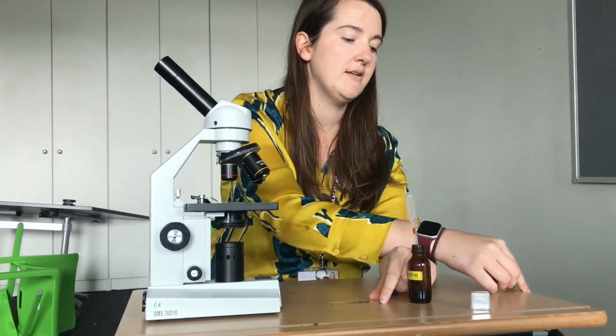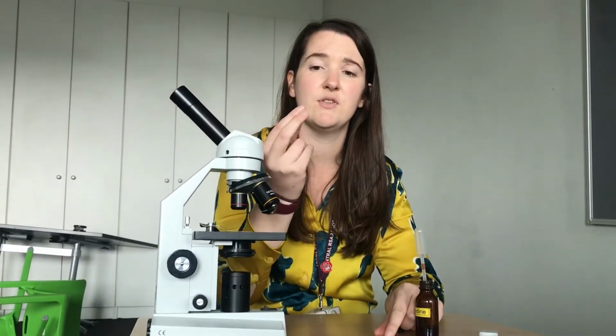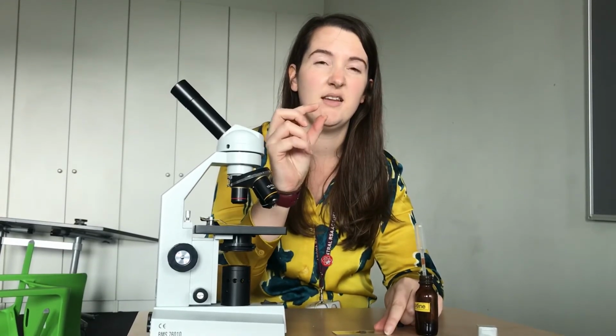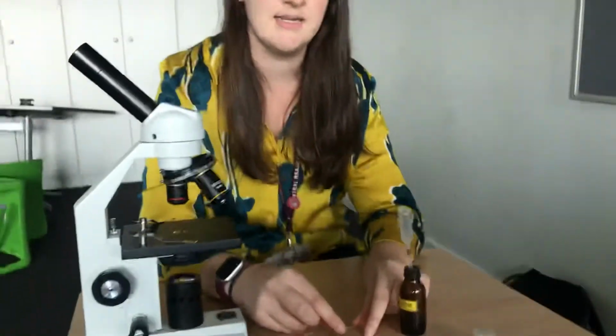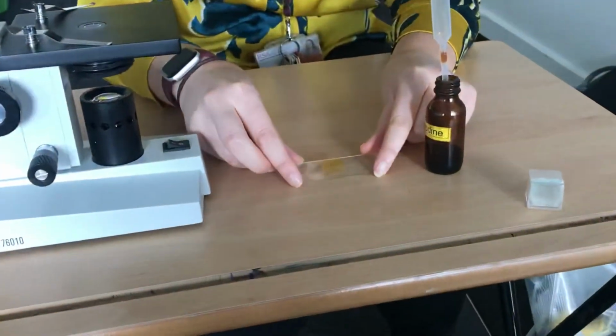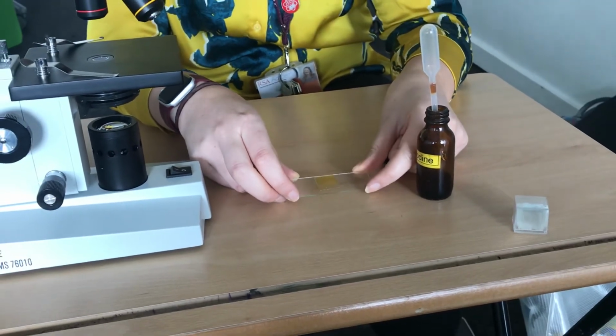Right, so when I put my iodine on top of my specimen, so from a piece of onion, I've got a cover slip, just a really thin piece of glass. If you squeeze that too hard, you'd break it and it would cut you, so you have to be really careful. I'm just going to drop that on top of where the onion is. You can see that it's yellow now. So that means when I look at the cells, they'll appear to be yellowy brown.